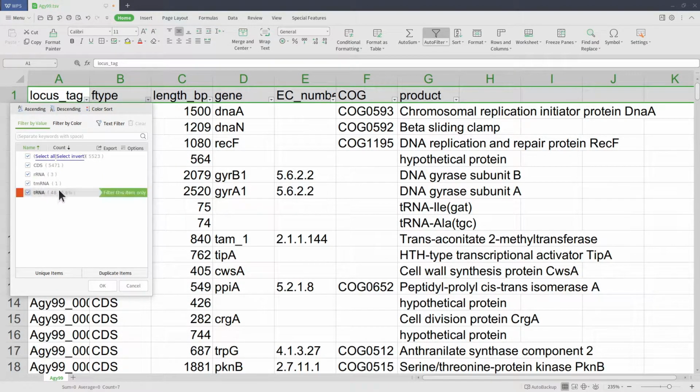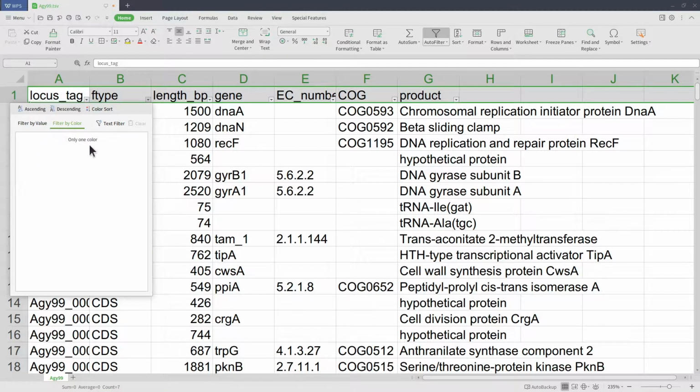So at a glance, we know that CDS, we have this, we have this, we have this. These are the features that were predicted for us by PROKKA. And it is this same information you find in the genbank file, just that the genbank files give additional information, but these are the features that will be present there, and we have their respective counts there as well. We have for CDS 5471, RNA, tmRNA, tRNA, and all those ones there. So this is also very helpful.